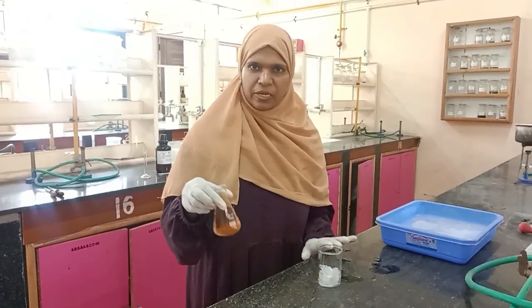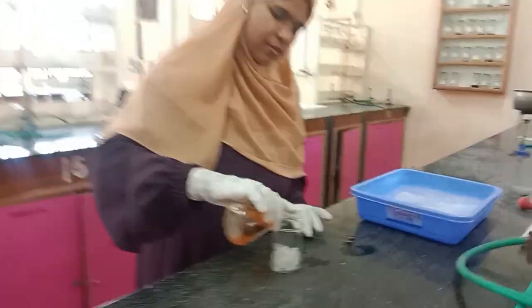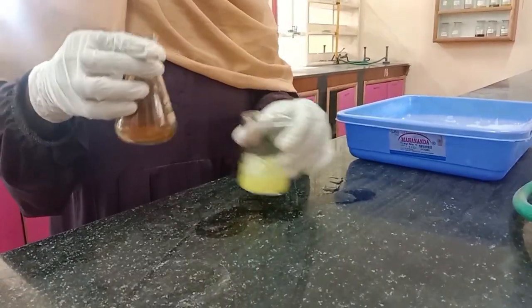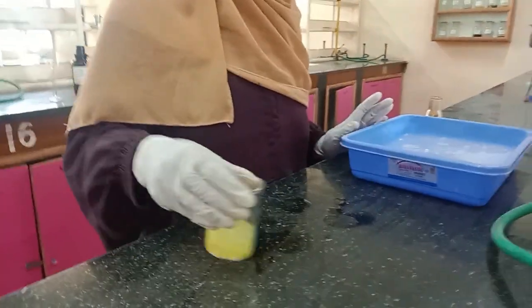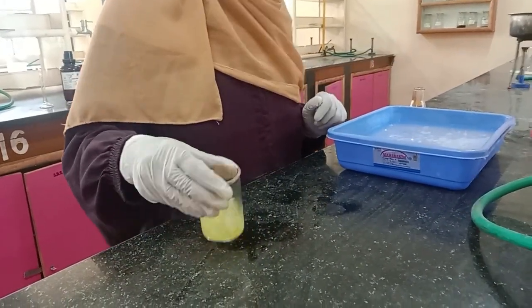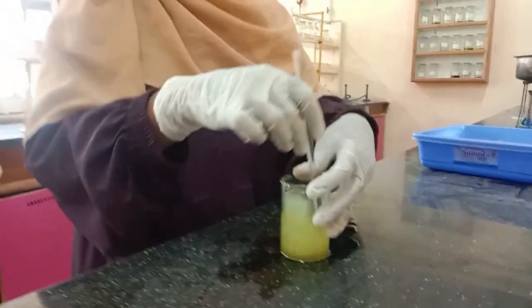After the 1 hour is completed, pour this solution in ice and continuously stir it for 10 to 15 minutes. Continue stirring for 10 to 15 minutes.